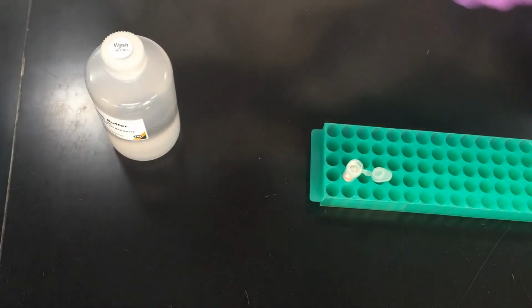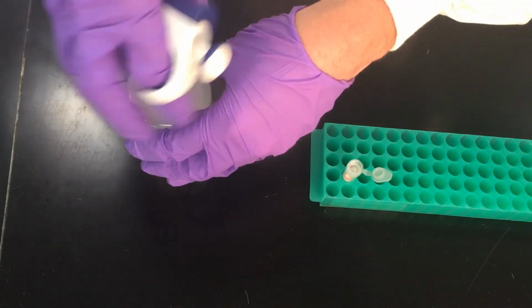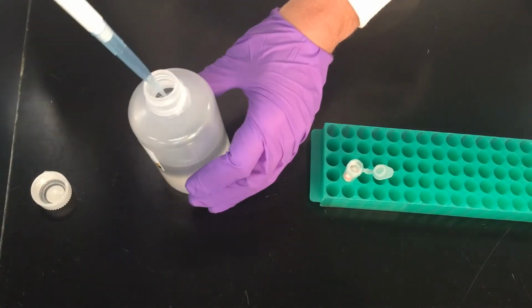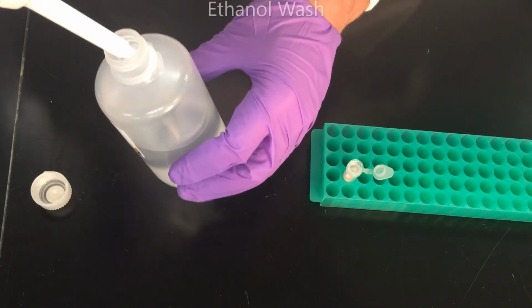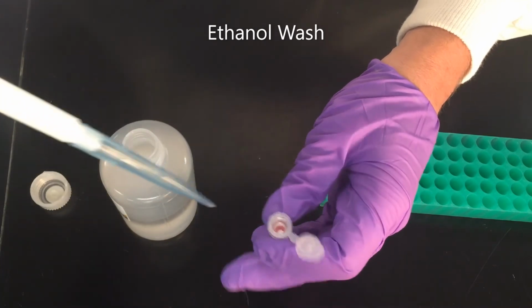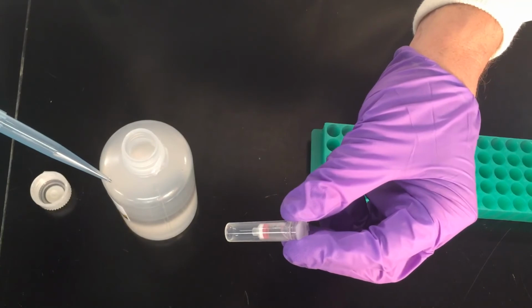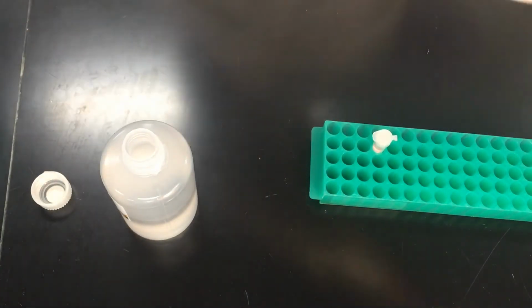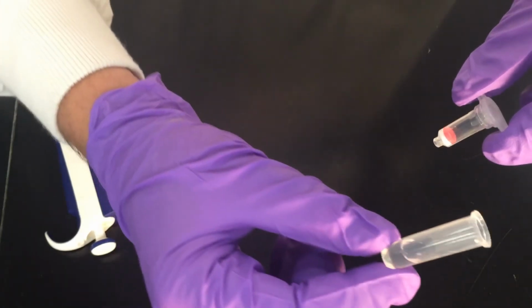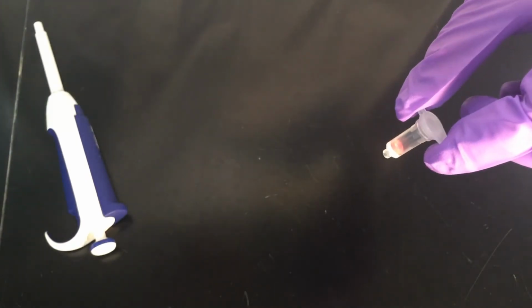wash it. So over here I have a wash solution, which is mostly just ethanol, and ethanol is a good wash solution for DNA because it will not react with it, and it evaporates very easily. So 600 microliters of that, and this is going to go back into the microfuge tube to allow the ethanol to pass through the filter and wash the DNA. So this has gone through the centrifuge. You can see that the ethanol has gone through the filter and washed this. So I'm going to dump that out.